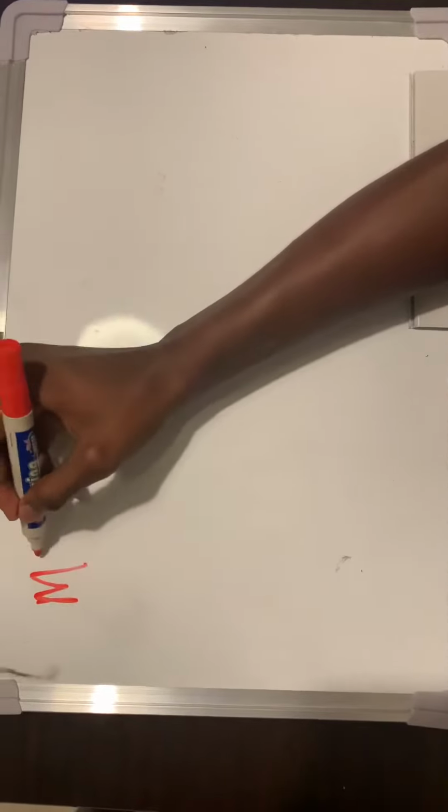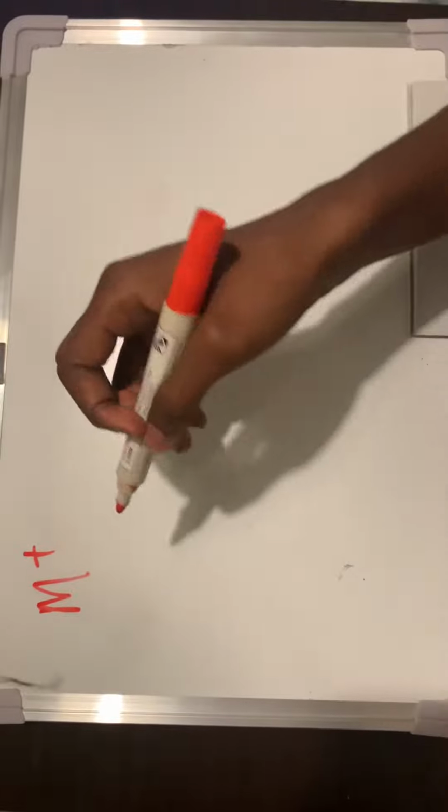Today we'll be talking about mass spectrometry. The sample, which is the organic compound, is placed in a mass spectrometer and bombarded with electrons, and this causes the molecule to lose an electron to form a molecular ion. And the notation for a molecular ion is an M+.